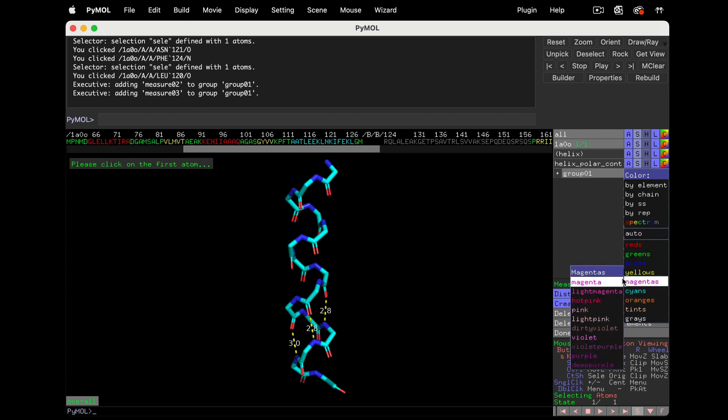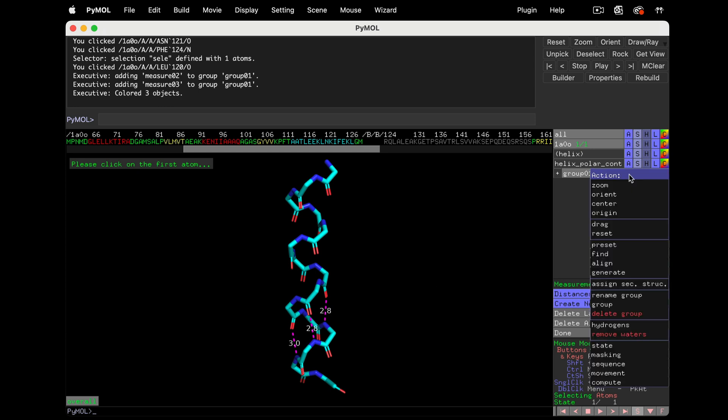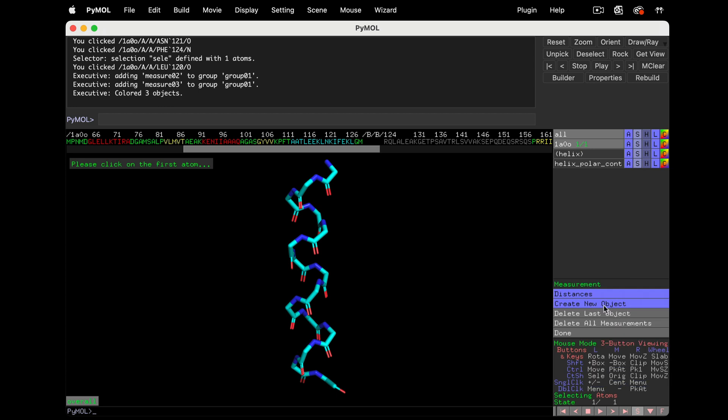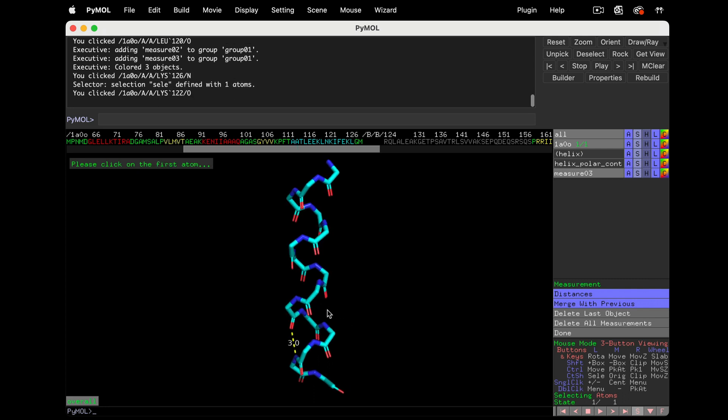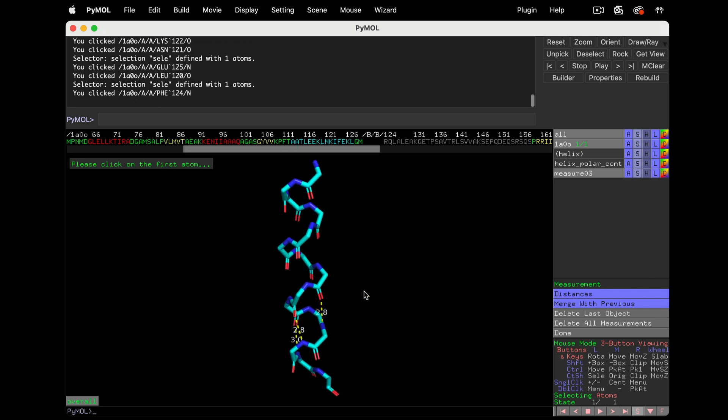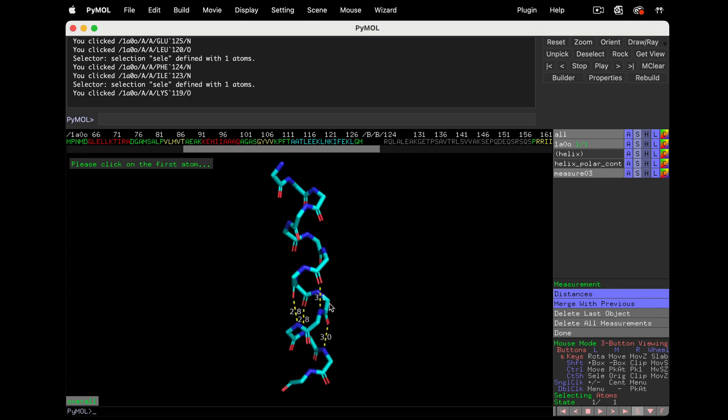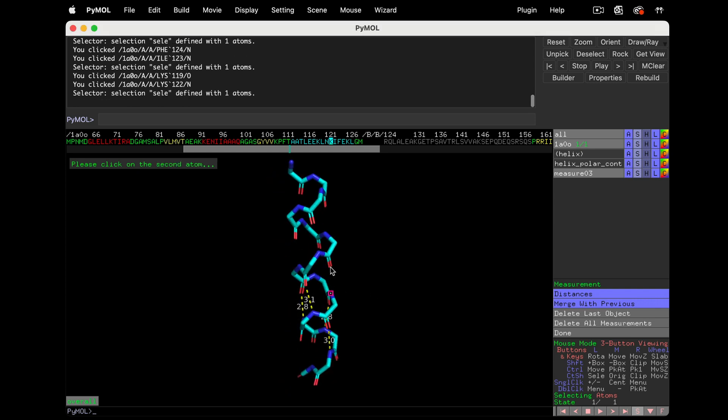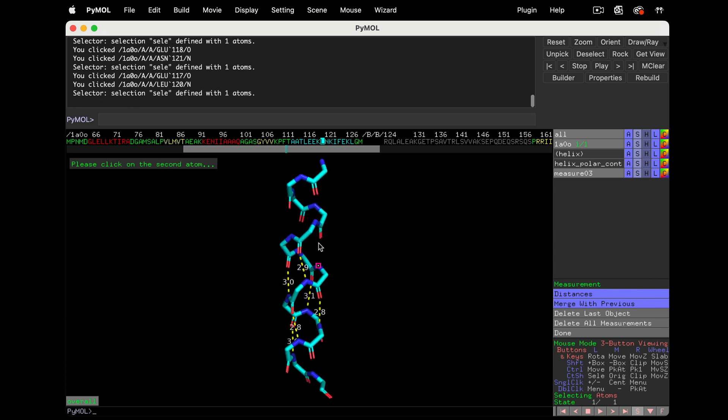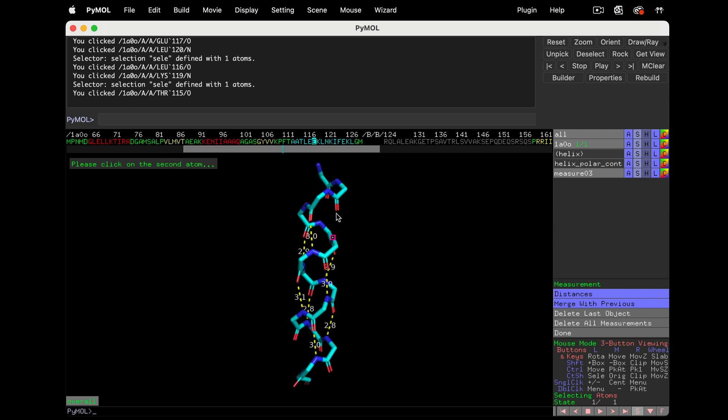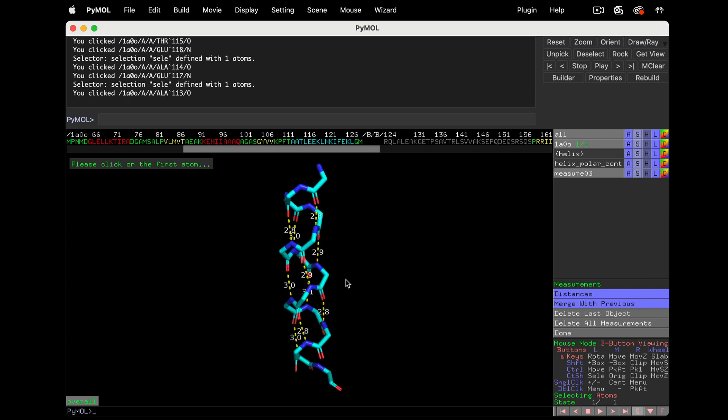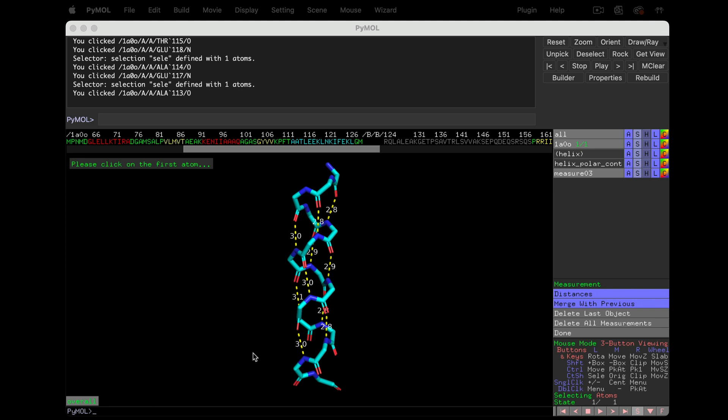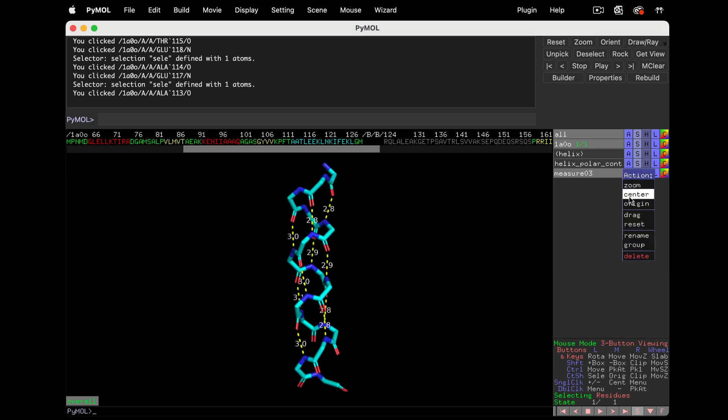Let's recolor them. There's another way to achieve this that I really like, but if you misclick you'll have to start over. First, let's delete our grouped object. Now, the purple parts of the Measurement Wizard have built-in menus. Click on Create New Object and change this to Merge with Previous. Now I'll start where we did before for the first measurement. Then carefully rotate to capture the others. Notice there's just one measurement in the Names panel and we're adding to it. Let's rotate and try to measure them all. Okay, I think we've got them. Click Done.